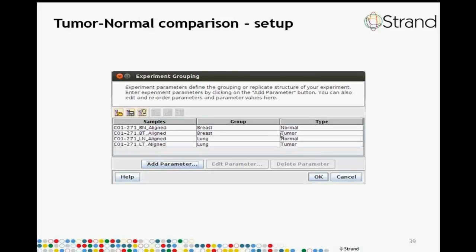So one way of doing that is to take a variant allele, see what is the percentage of supporting reads for that variant allele in the tumor, what is the supporting read percentage for that variant allele in the normal, and if the tumor has a lot more supporting reads than the normal, then one would consider that variant allele to be specific to the tumor. So in other words, we need to take a difference of the supporting read percentage between the tumor and the normal. And if that difference is high, then one would consider that variant allele to be present in that group.